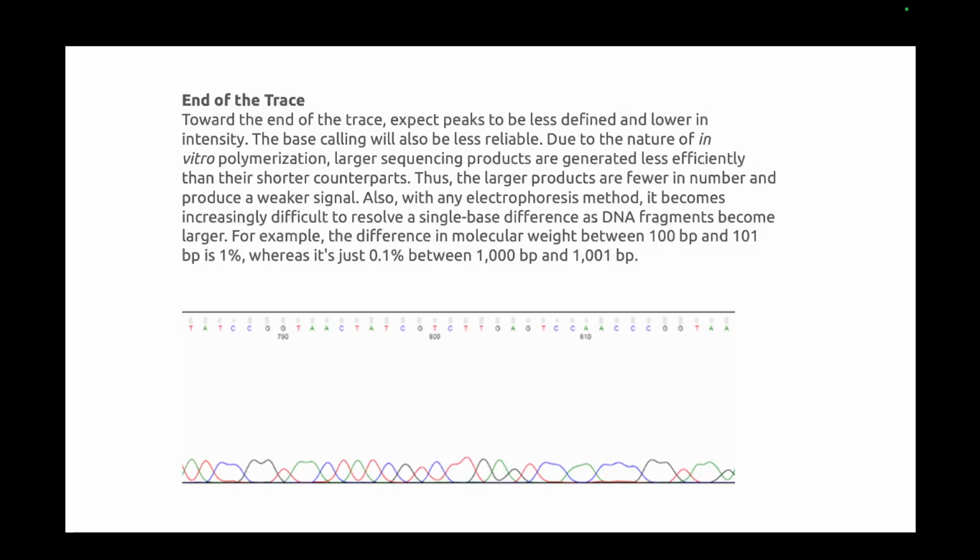And towards the end of the chromatogram, expect peaks to be less defined and lower in intensity. The base calling will also be less reliable due to the nature of in vitro polymerization.